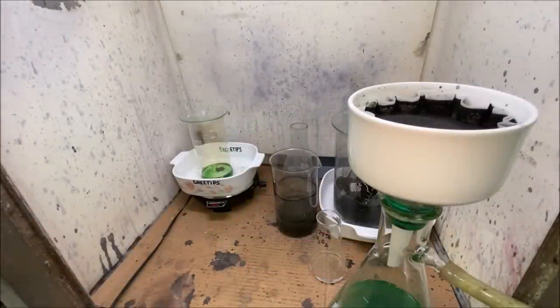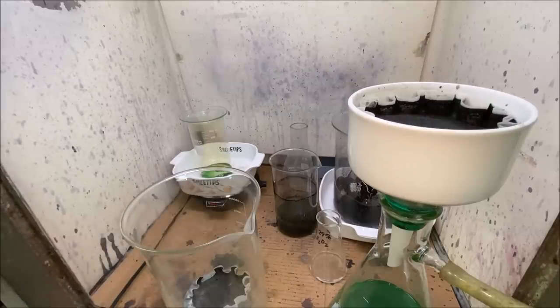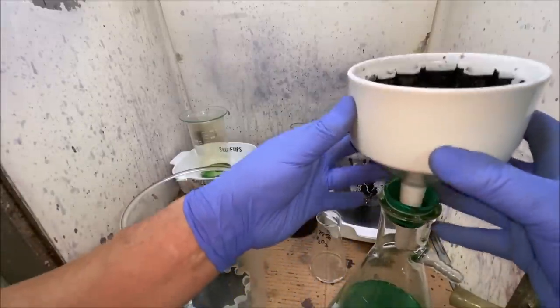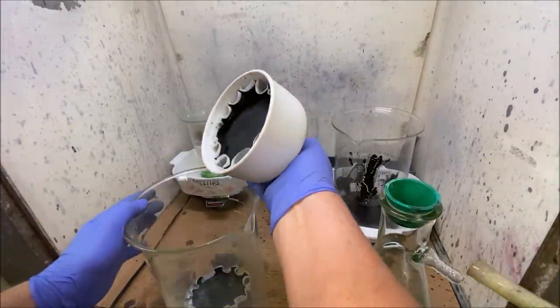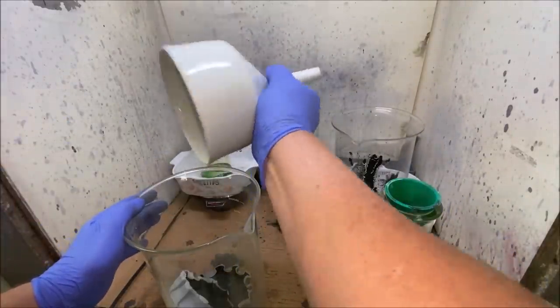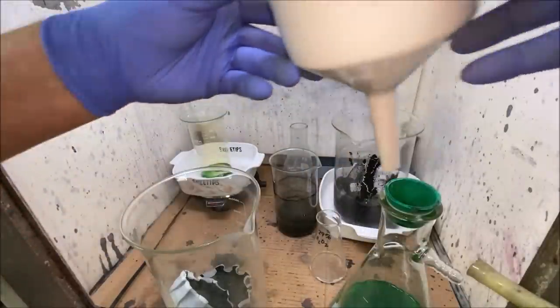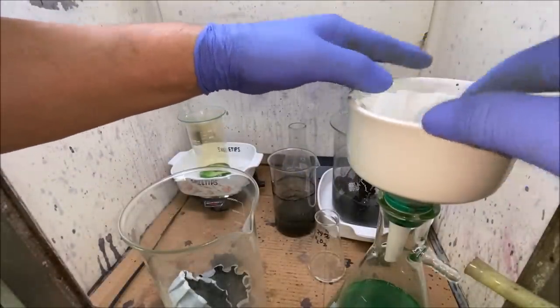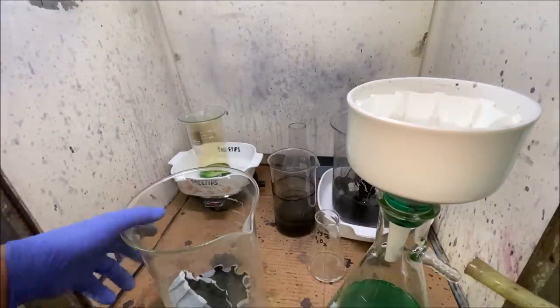Now what we'll do is transfer our funnel here that's got the filtered solids in here. Hopefully we'll get it to come out as quick as easy as, there we go. Bang. Here's our microfiber filter. I've got another filter prepared for this. And we're going to move this out of the way now.